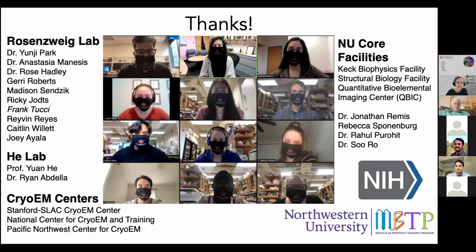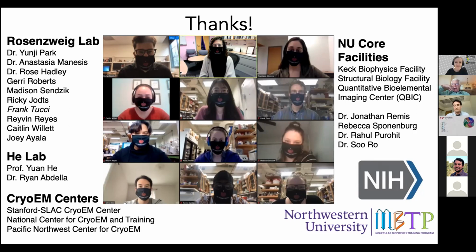Okay. Great job, Chris. Thank you for that great talk. We have a question. Could you explain more in detail how you perform the 3D classification to find the different classes of the copper C site? In general, when you're trying to do the 3D classification, do you provide a mask that just covers that part, or did you try 3D classification on the whole object?